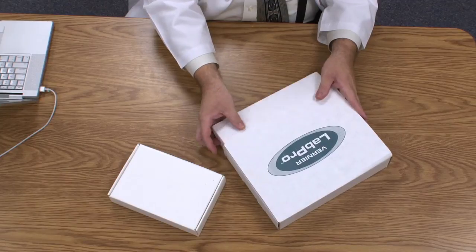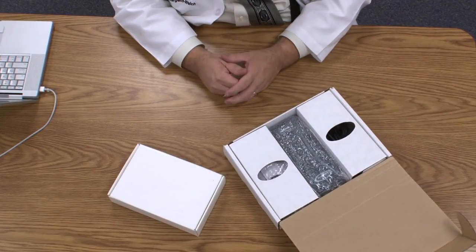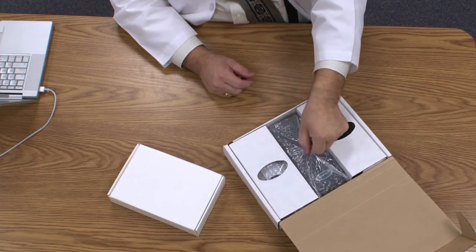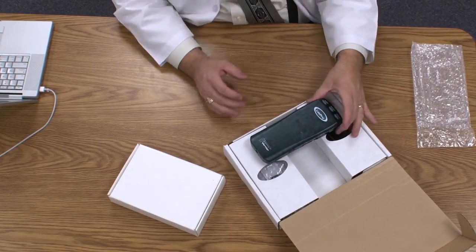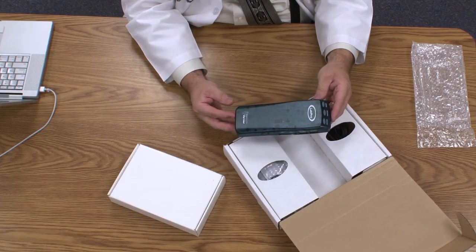This is the Vernier LabPro equipment that you should have on your campus. If the box has never been opened before, it should look something like this. In the middle compartment is the actual LabPro data interface. This is a device that takes the data from a probe, translates it, and sends it into the computer.